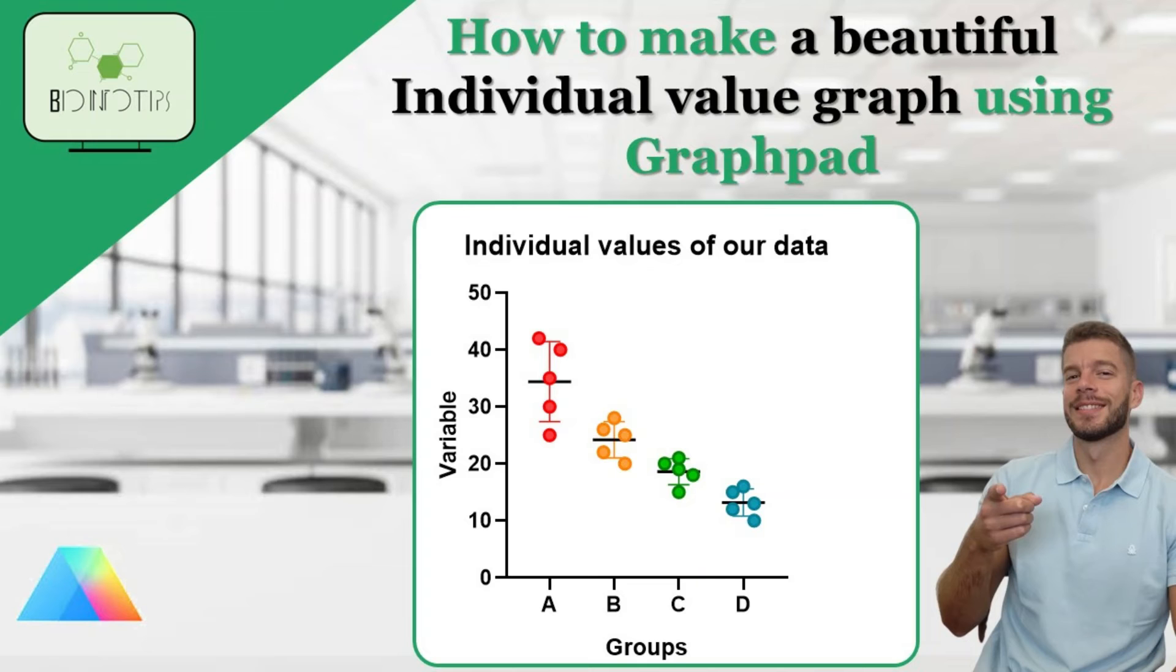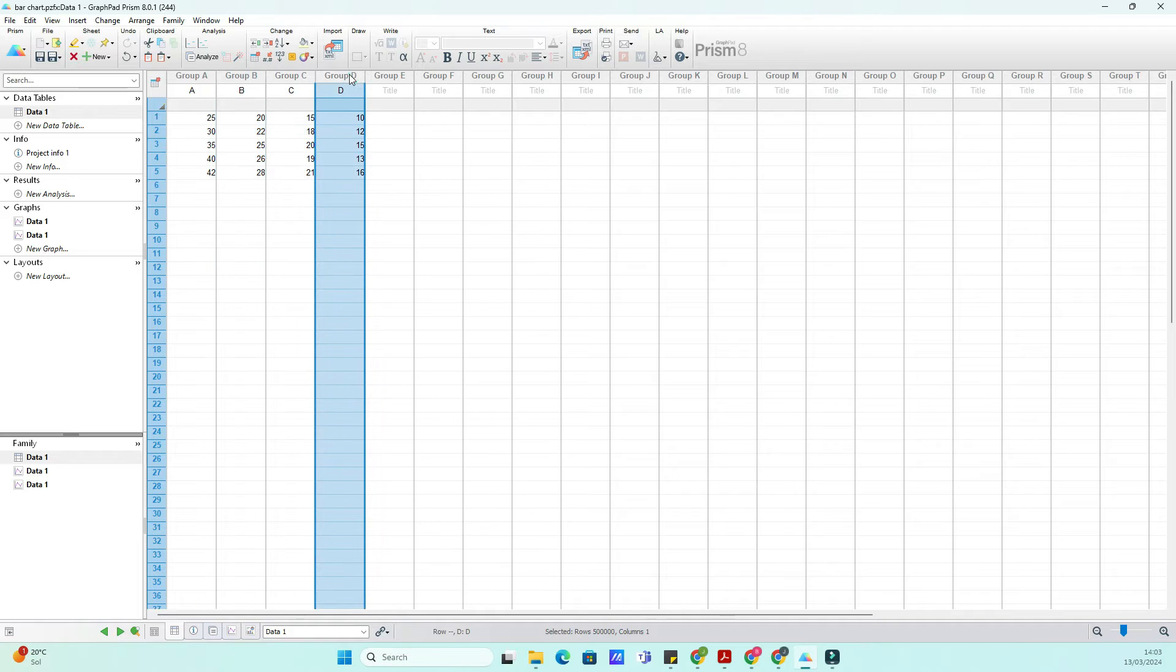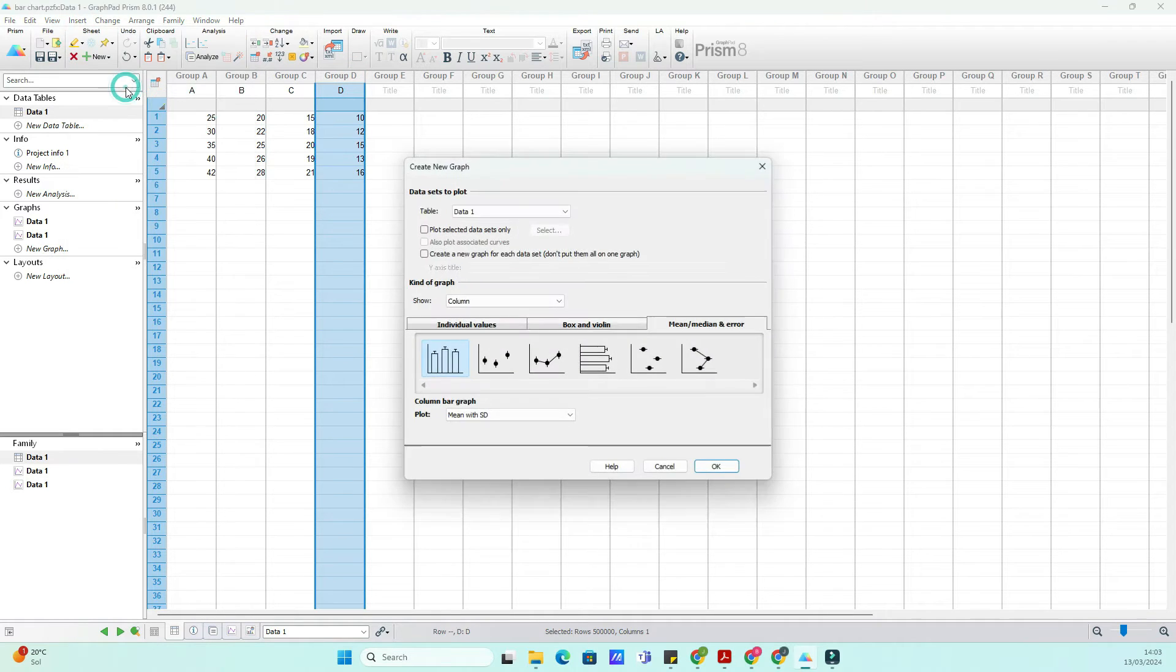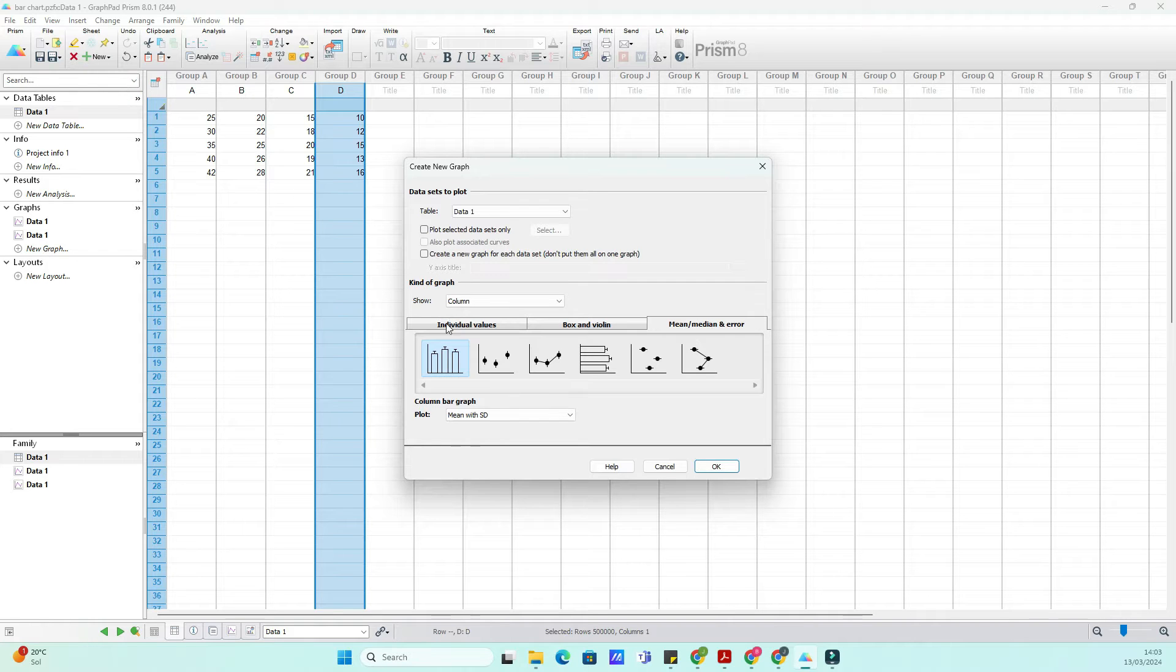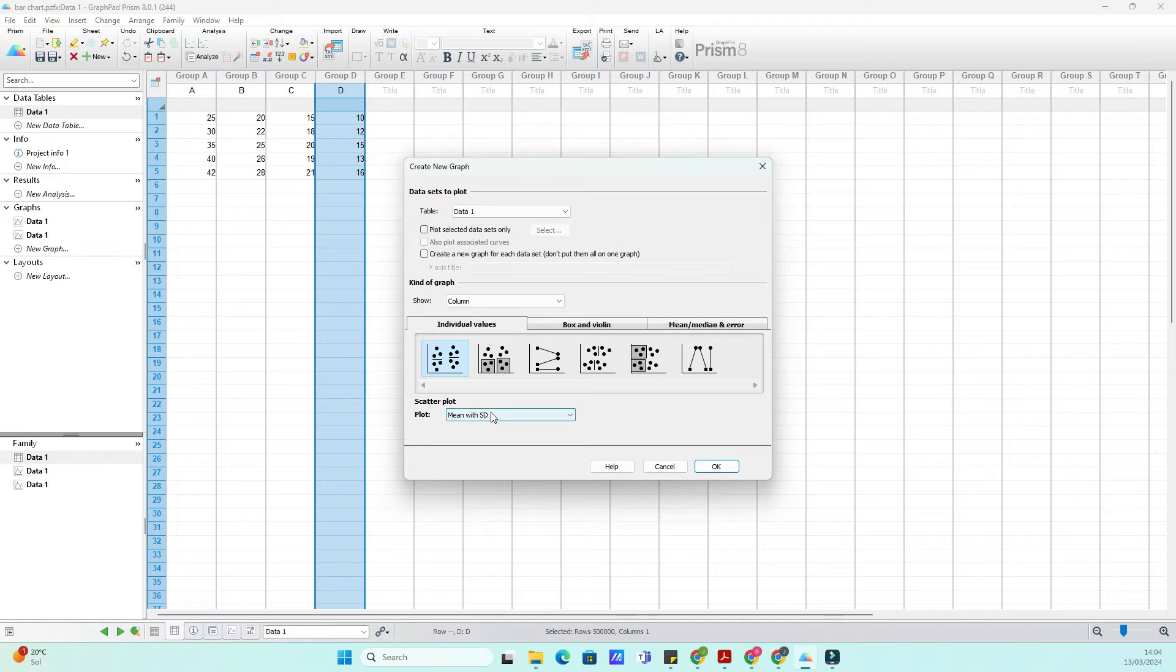Hello, and welcome to our GraphPad tutorial series. Today, we're going to delve into the art of creating visually captivating individual value plots. These plots are not just informative, they're beautiful representations of your data that provide transparency for the number of samples used.